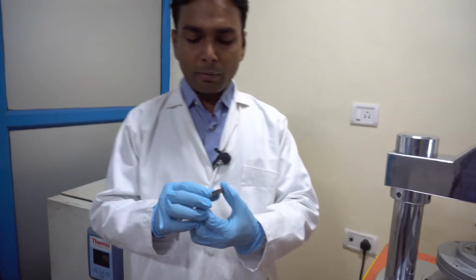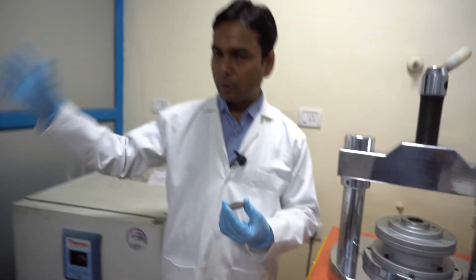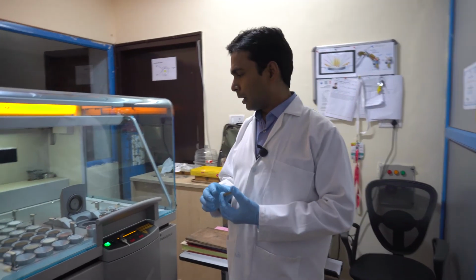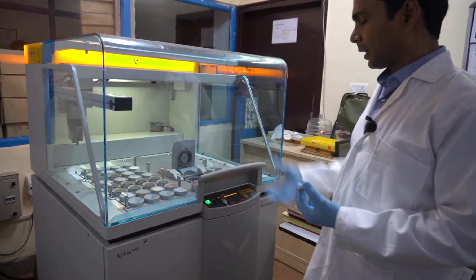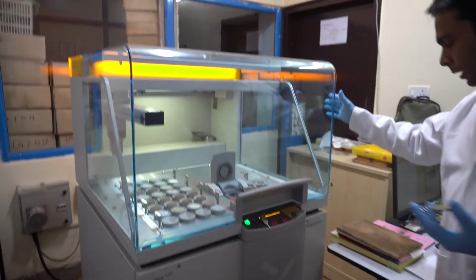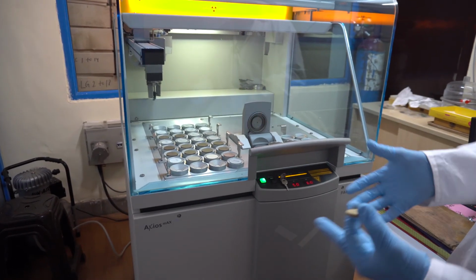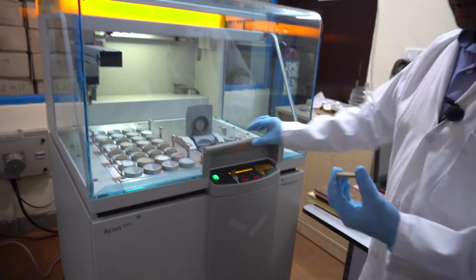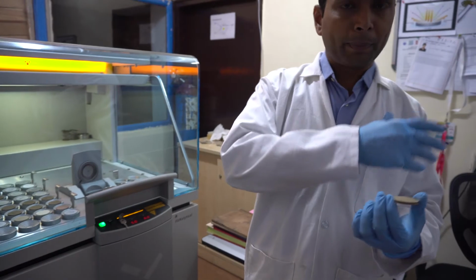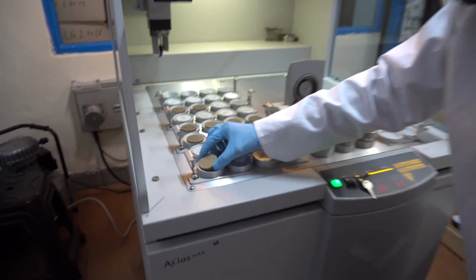This is a pellet made by the hydraulic press machine, and after that the pellet is introduced into the sample holder. After making the pellet, now I will show you how the sample is analyzed in the XRF machine. So this is the WD XRF machine. Inside the machine there is a source, a sample holder as well as a detector. We put the pellet in the sample holders like this.